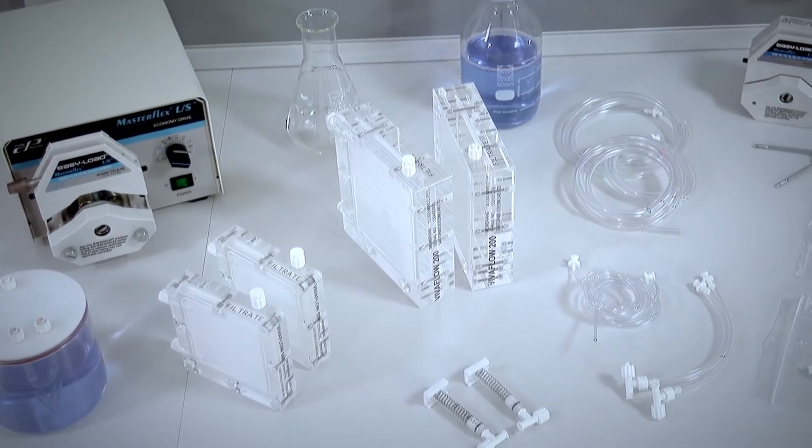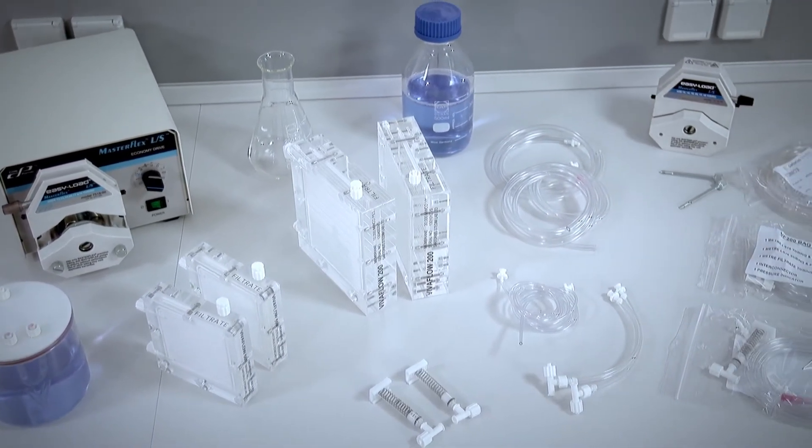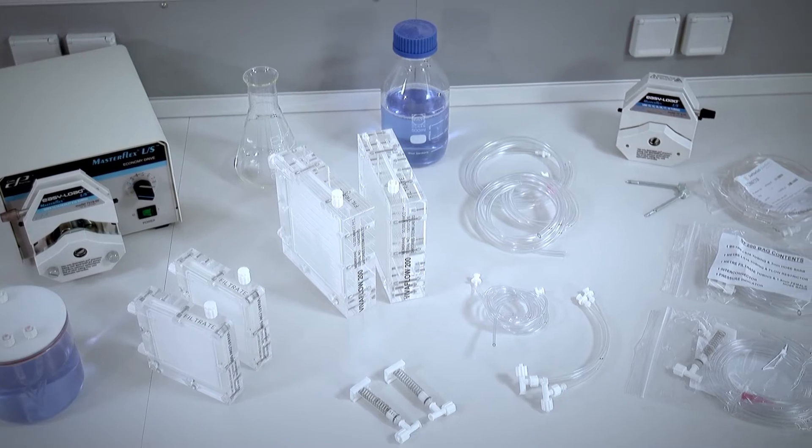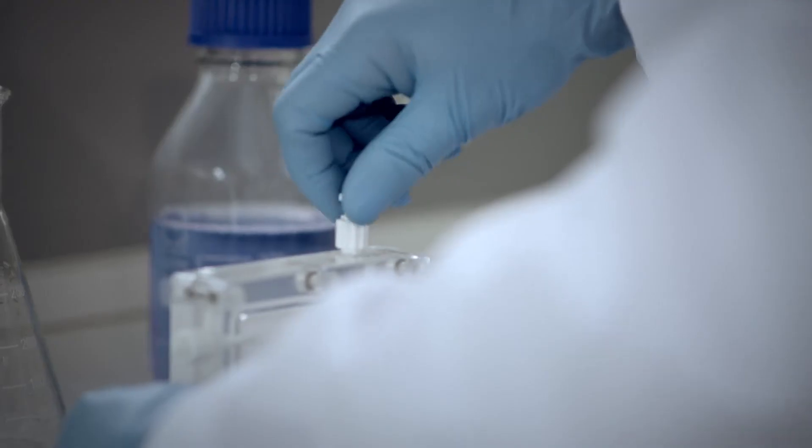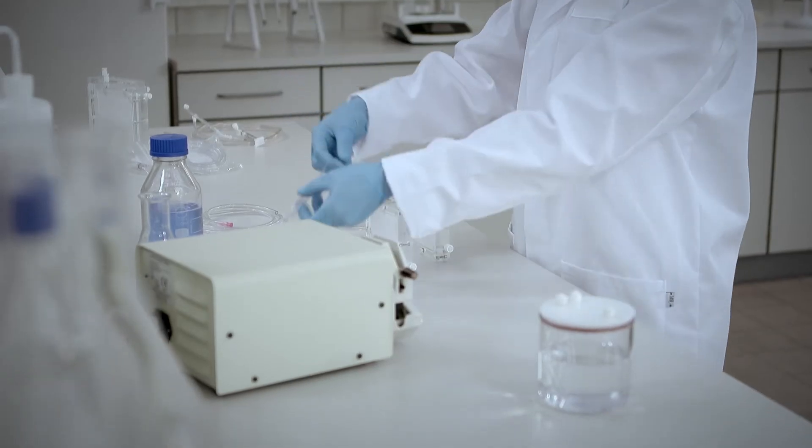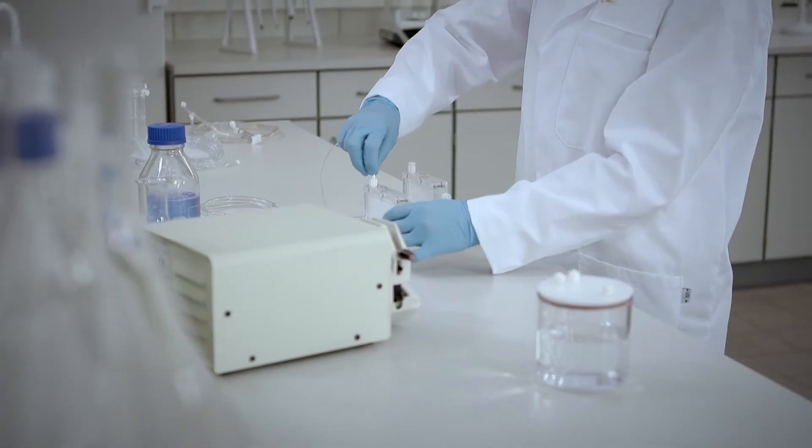VivaFlow units are convenient to operate using a standard laboratory peristaltic pump. They are so straightforward that they can be intuitively used and need only very few accessories in order to operate.